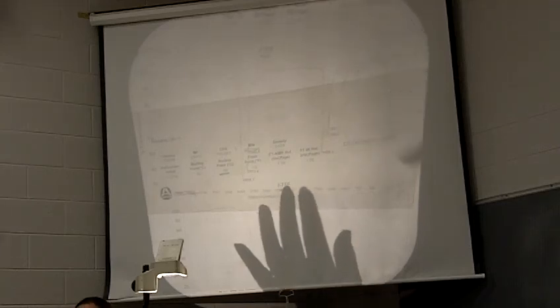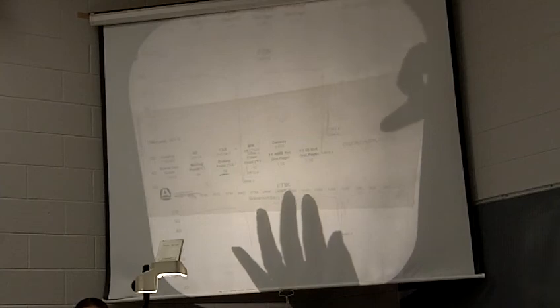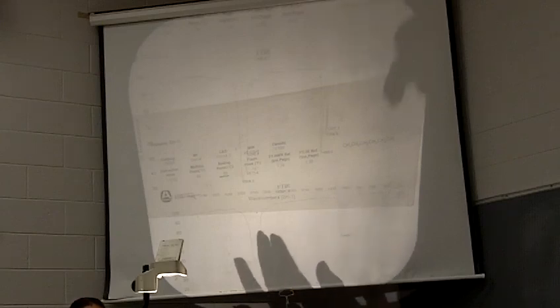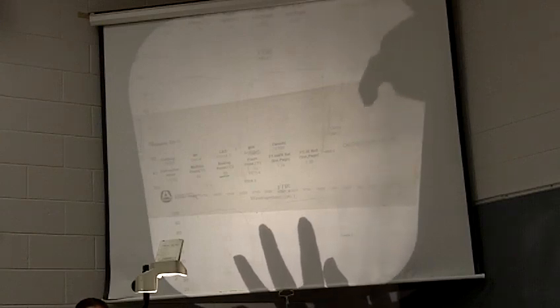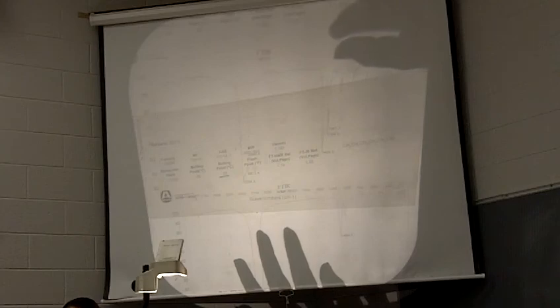Now, relative intensity of peaks can change with how much sample you have, but what they look like, what their relative intensities are, and where those peaks fall, what wave numbers they're at, should be the same in the fingerprint region. So that's what you're going to use the fingerprint region for. You're not going to identify any specific functional groups for the peaks in the region, but you're using that to match up your information with what you say the known is. Okay? Does everyone see that? Okay. So make sure your fingerprint regions match.